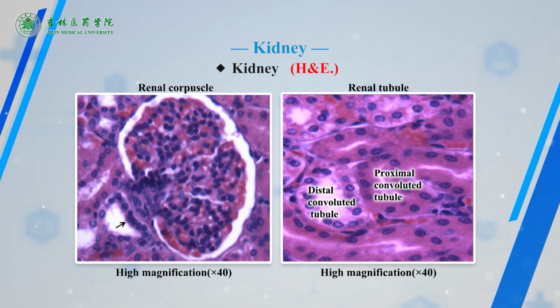Perhaps you can find a renal corpuscle connected with the proximal convoluted tubule at the urinary pole, or one connected with the afferent or efferent arteriole at the vascular pole. Look at the proximal convoluted tubule. The apparent feature of these tubules is the deeply red-stained appearance. The tubules, always cut in transverse and oblique sections, have a rather thick wall and a relatively small irregular lumen.